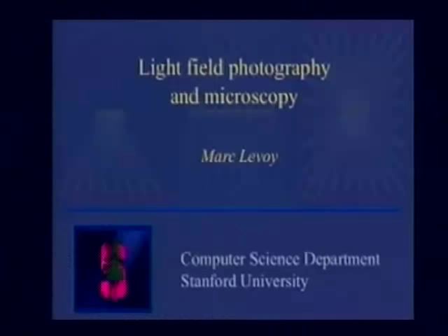So with that, let's start. My current research area is in general computational photography. One branch of computational photography is the sensing and display of light fields, and that's what I'll be talking about today. It's light field photography and microscopy. The first thing I should do to bring everyone up to speed is define what a light field is. So I'll have just a couple of theoretical slides about light fields. Most of the talk will be about applications of light fields, as you'll see in a moment.